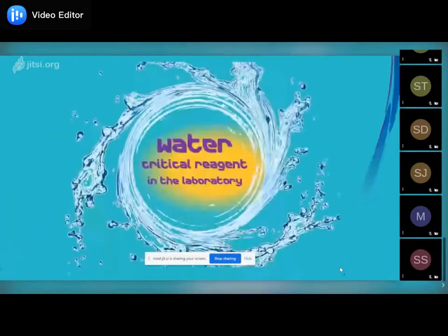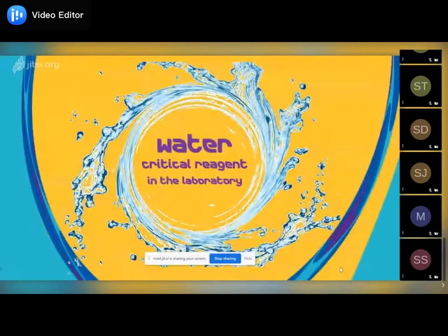Now the question comes, why do we need good water in the laboratory? Because water is the most critical reagent in the laboratory. Whenever we work in the laboratory, in the majority of places we forget water as a reagent. We consider water as just water. We use it only for some dissolution, sometimes for making some media, some buffer and all those things.